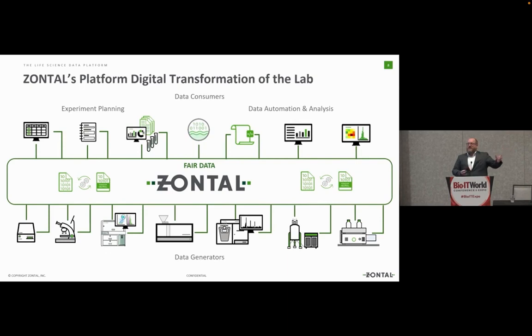We are orchestrating the workflows. Whenever we can, we take data like a request, an instrument request, a sample request, whatever, a test request from an ELN system. We take it, we interpret it, we change it so that the instrument that this request is for actually understands it. We send it to the instrument. So when the scientist goes to the instrument with her samples, then the sample list is already there. They can put in their plate or their vials and push the start button to test.